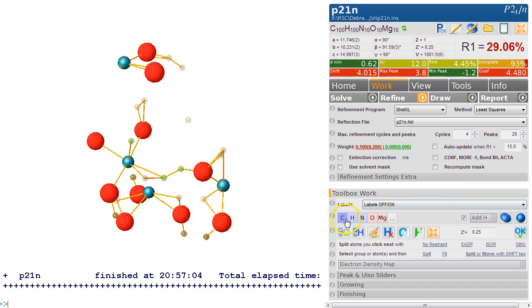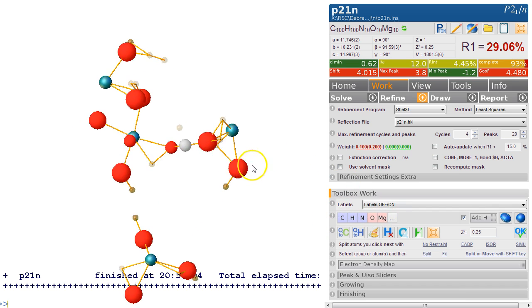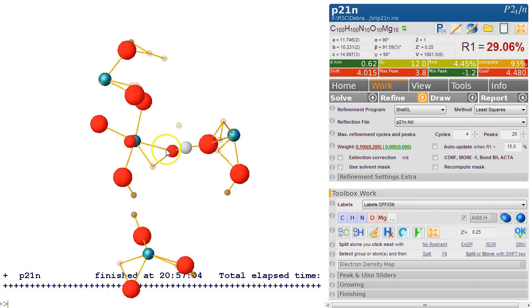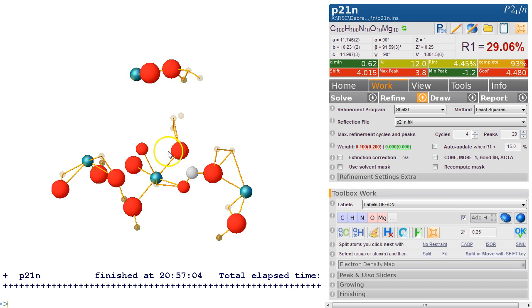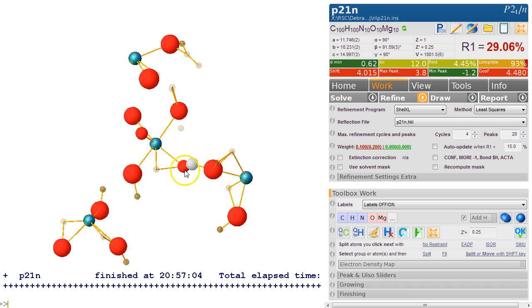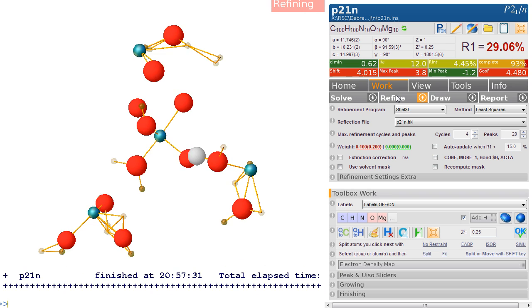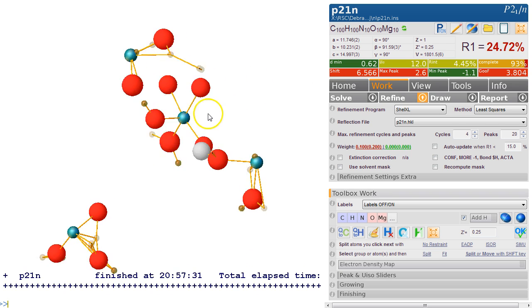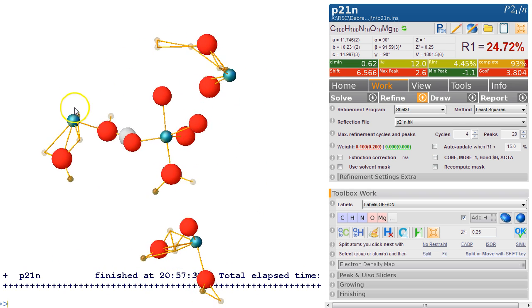We're going in here, we're making these ones more oxygens. This one's probably a carbon if that's the case, so we have a carboxylate—I am a formate possibly. But what is very strange here is that these magnesiums are quite small and these oxygens are quite large. Let's see what's going on here. So something is wrong here.